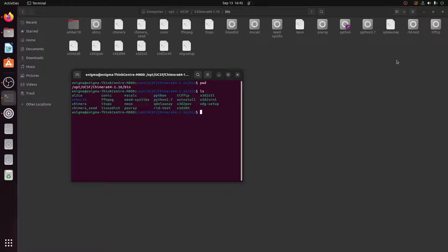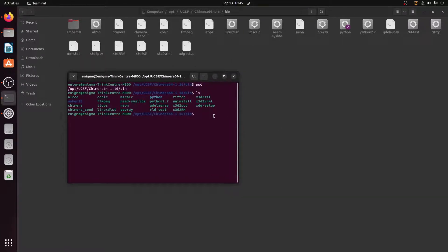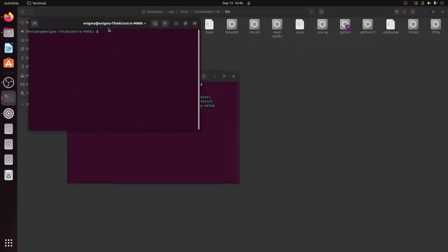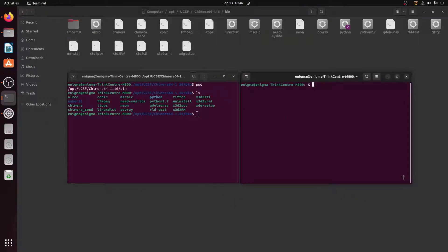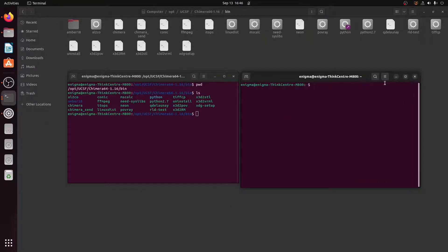Now I will open the .bashrc file to make some changes. I'll open another terminal by pressing Ctrl+Alt+T on the keyboard. I'll keep this terminal alongside the other one. In this terminal I will write a command to open the .bashrc file. I'll type 'gedit' followed by a space and then '~/.bashrc'. This is a system file of Ubuntu — if we edit this file we can make changes.